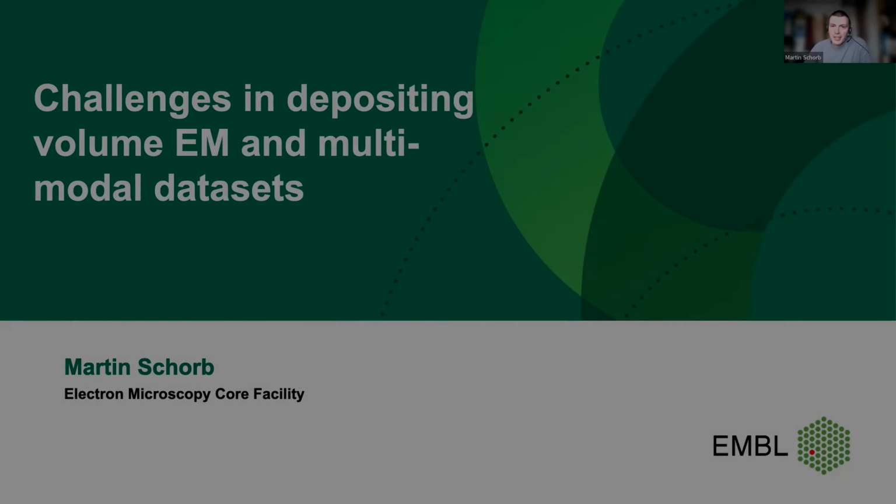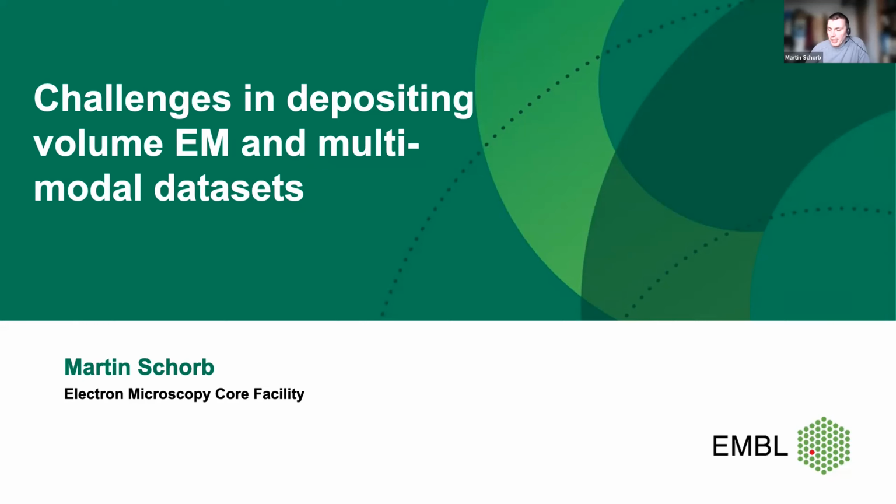Hi everyone, I'm Martin. As Isabel already said, I work at EMBL at the Electron Microscopy core facility, and obviously because we are part of that institution, we drive forward public deposition of all our data that we collect. And I'm somehow the person that is always responsible for depositing the data, and that means I have very good connections to the developers of the archives and repositories, and I'll just give a little overview of what we do and how we do it.